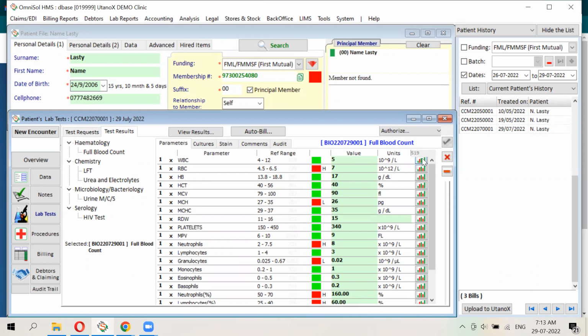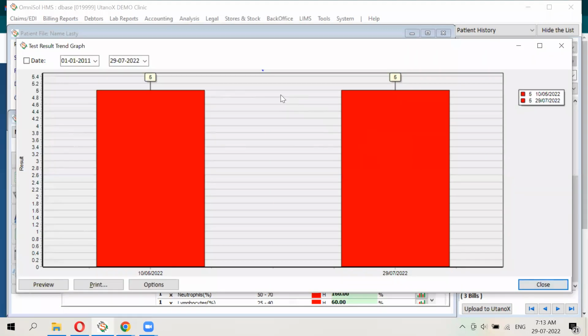It's possible, although usually in the standard, we just show this specific request. This can be sent separately. As you can see here, you can print this separately, or even electronically send this one as well. But it can be made one comprehensive report if you want it to be.